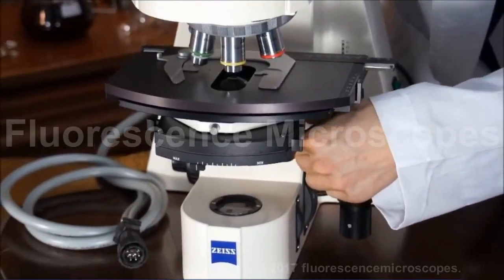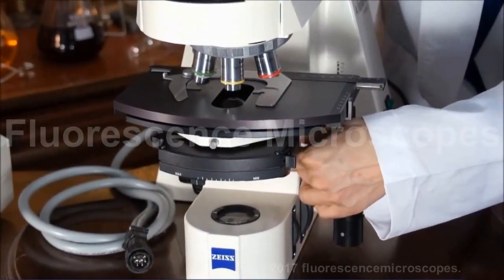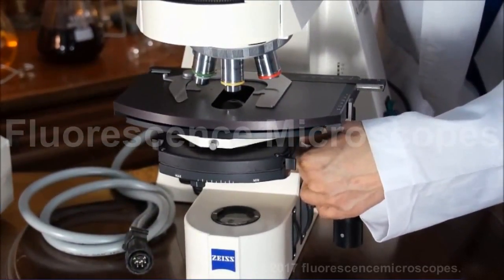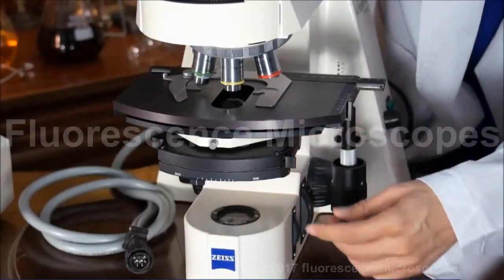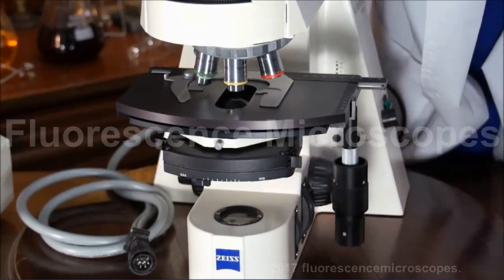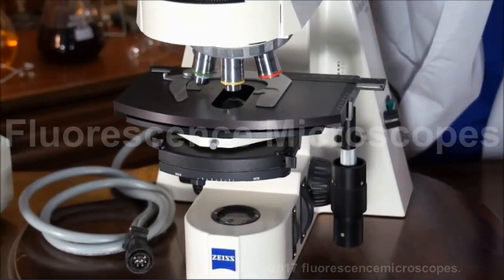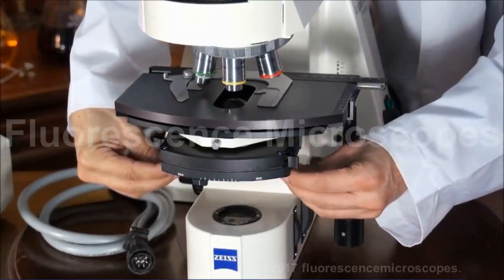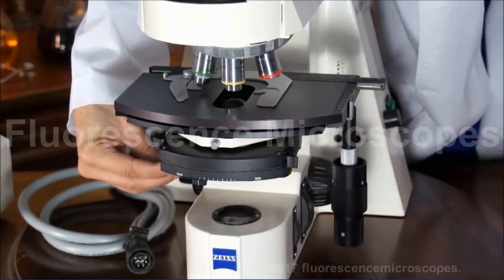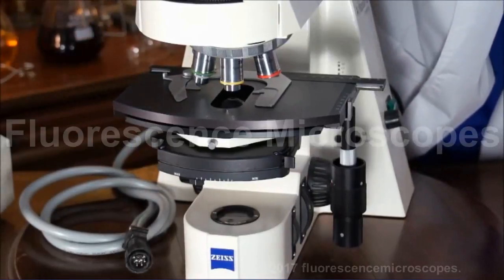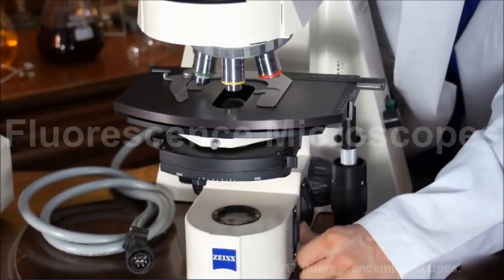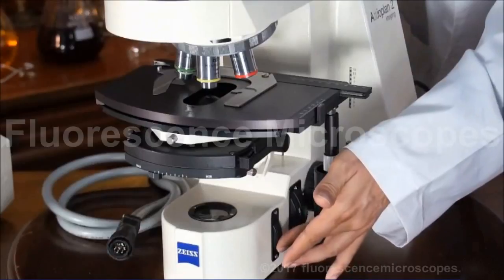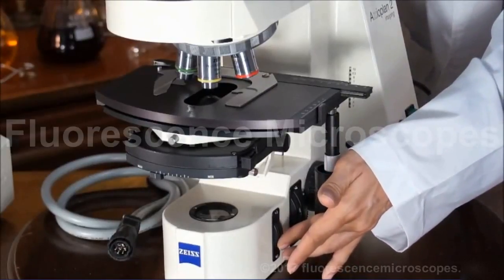Raise and lower this condenser so that it's at the precise location where the luminous field diaphragm is in focus, and at the same time center that luminous field diaphragm. Then open the diaphragm back up just so it's a little bit outside of the field of view.